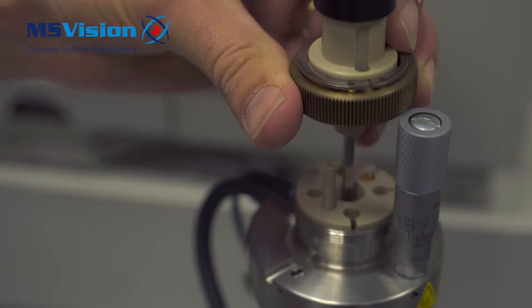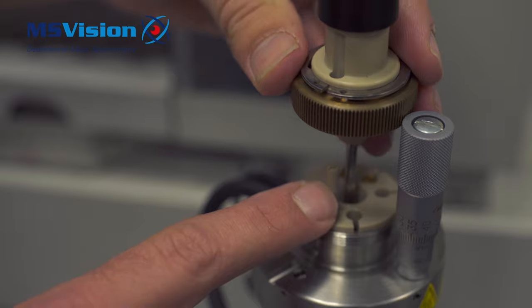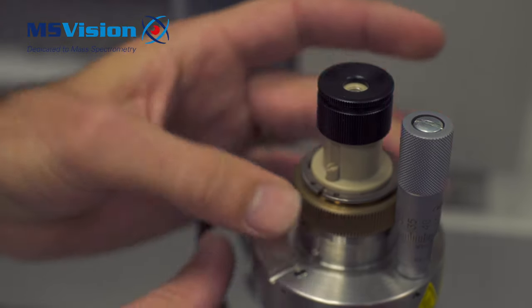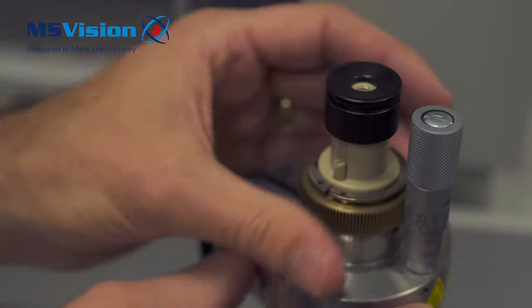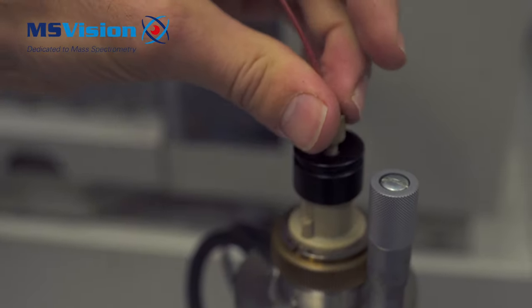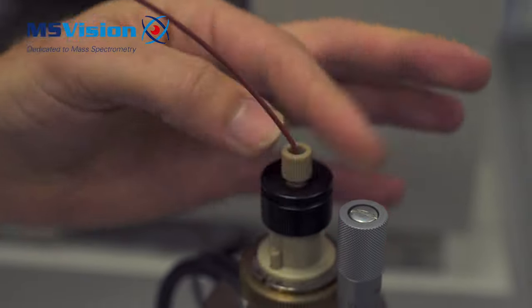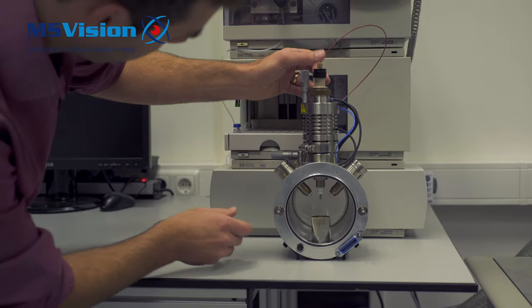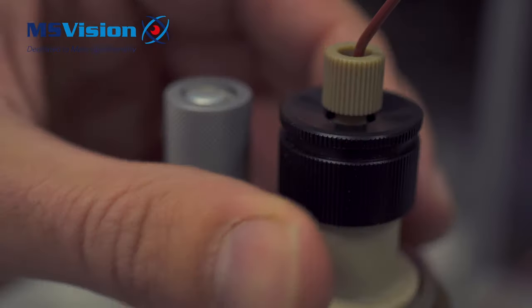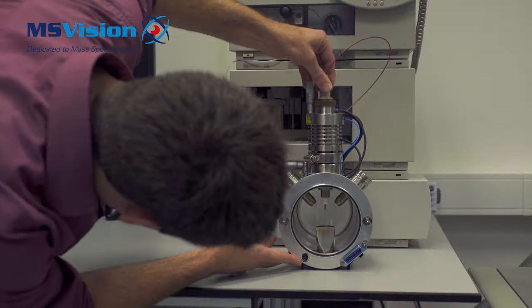Put the probe back into the source and tighten the brass nut. Now adjust the black cap and have the capillary protruding by 1-2mm.